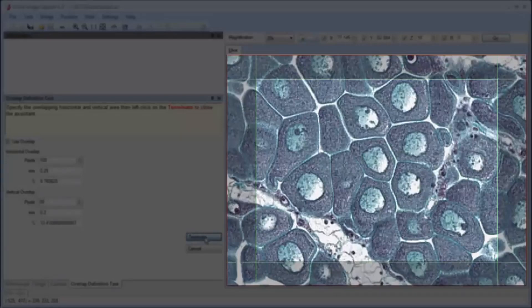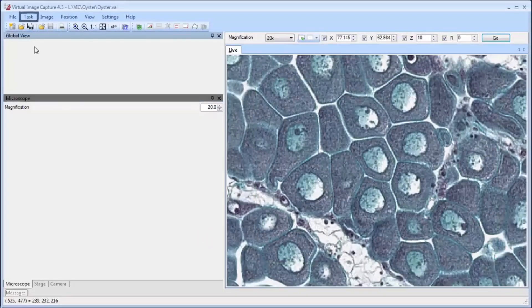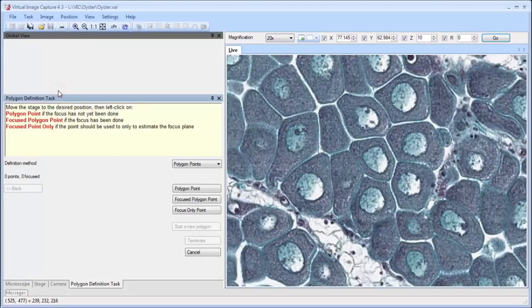To define the total region to be scanned, we select task, then capture rectangle, and then choose the columns and rows method.